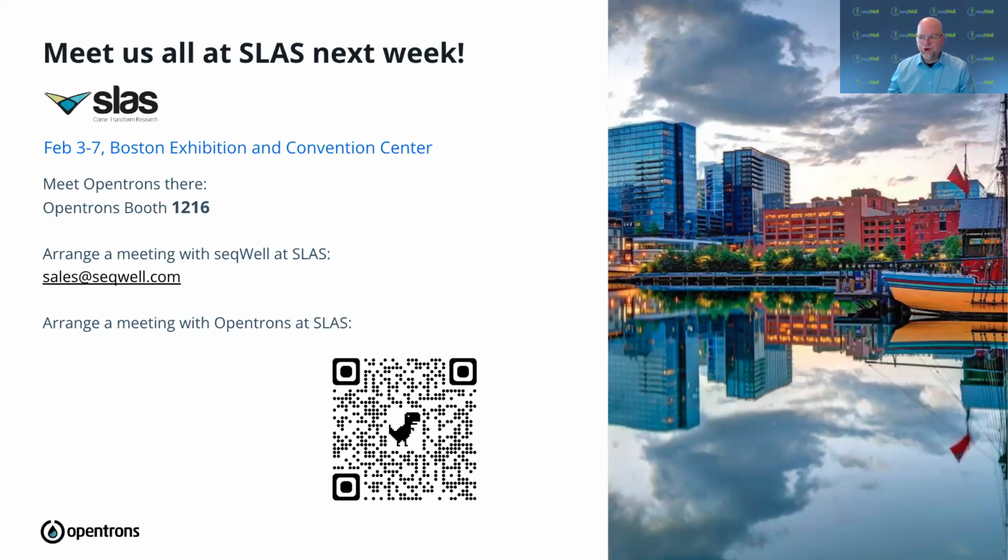Question from Chris Boyles. What is the typical plasmid size that the kit is designed for? We have worked with a variety of plasmid sizes. He asked 4 kb, 10 kb, larger. We have definitely worked up to 10 kb with no issue. I'm feeling confident we can go above that. The way the overall chemistry works, larger is actually a little bit better here. So again, feel free to reach out to us with your particular plasmid size, and we can walk through that.